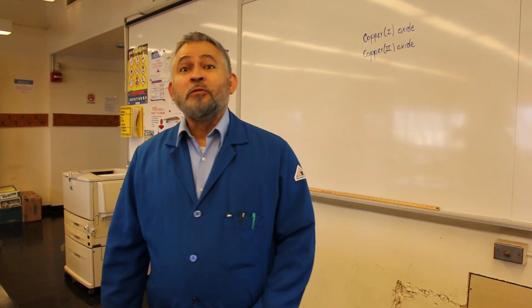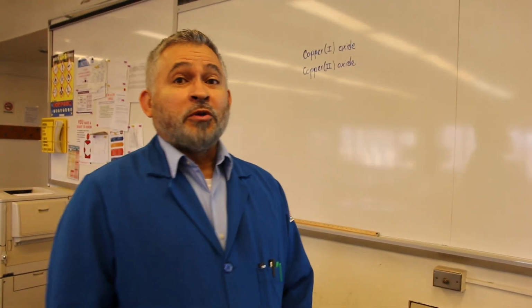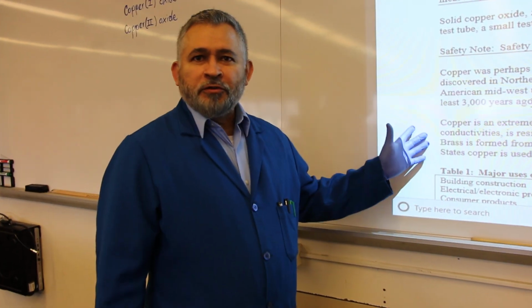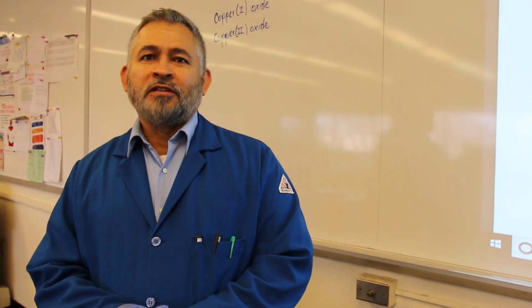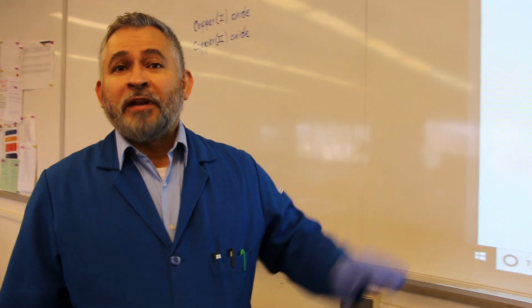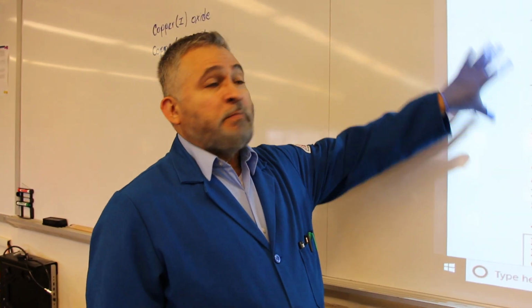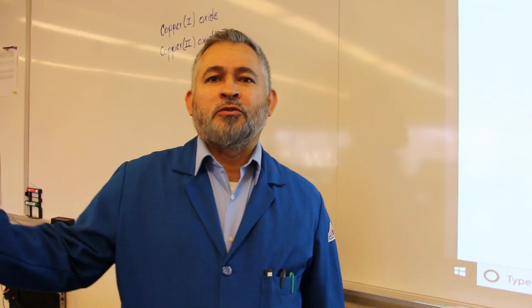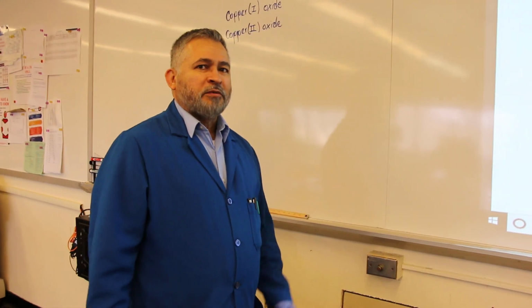We are going to prepare some demonstrations for the labs so you can follow your procedure according to the protocol that is online. You can download this from the website. I'm going to explain every step. So my recommendation is to prepare this document in front of you and follow what we are doing here. You are going to do the actual demonstration for the experiment.